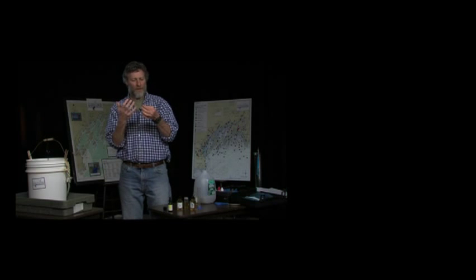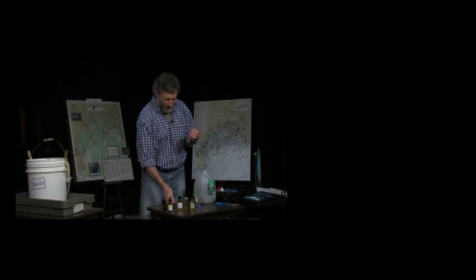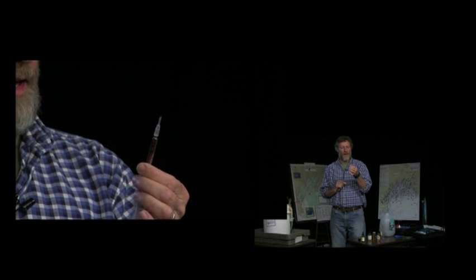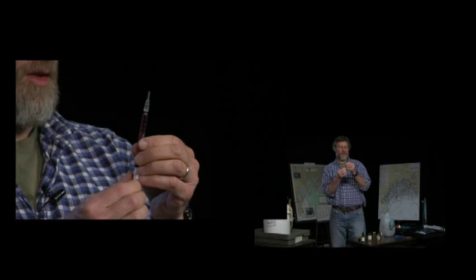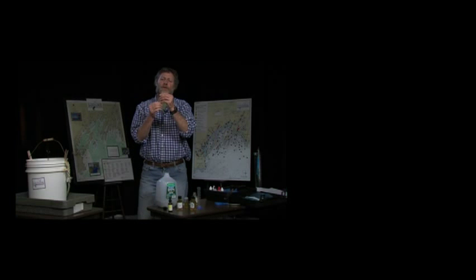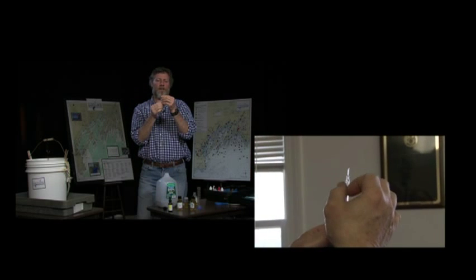The reason for filling it up beyond the markings is that I have extra fluid. I'm going to add a little tip to the end of this syringe that will make the droplets a little bit more refined. It's a little plastic thing called a titrator tip. Now we're going to use all that extra fluid that I put in here to fill the tip of the syringe. We'll squish it up a little bit like that. If there are any air bubbles, you can tap it like this a little bit. If you have your syringe pointed up, the air bubbles will want to climb to the top. Give it a little tap, and then you can squeeze some more out.